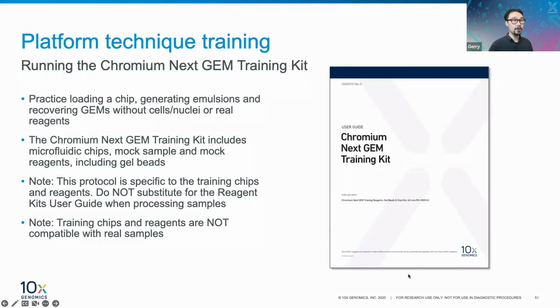There is a protocol for this, and I will be sending it out to the people attending these sessions. But just note that this particular protocol is specific to the training kit and has different volumes and everything compared to the actual real kits that you will use when you run real samples. And these training chips and reagents are not compatible with real samples. Just take note of that.